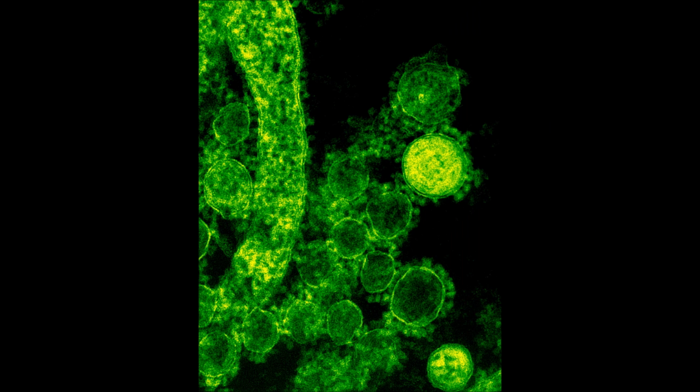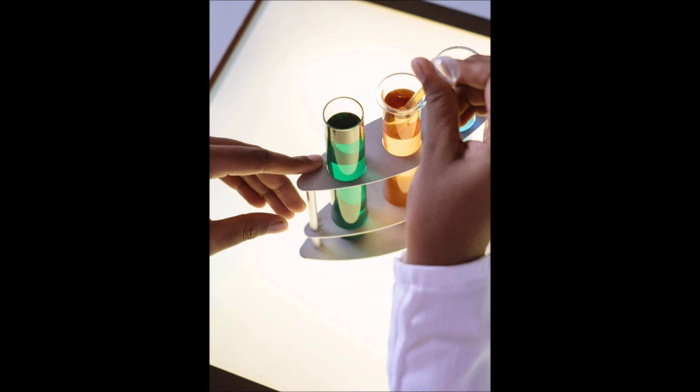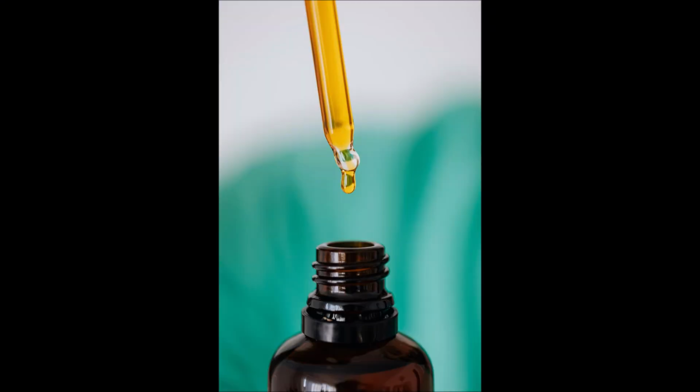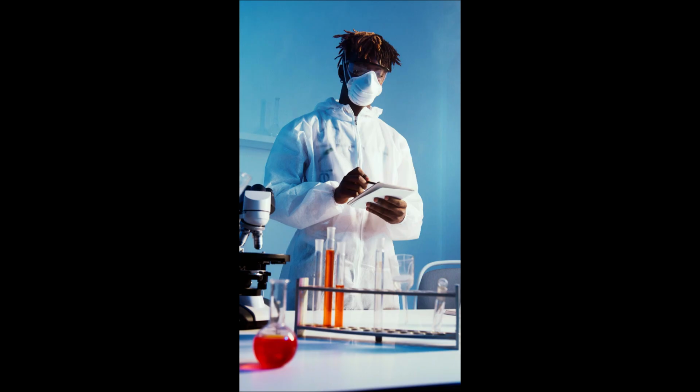Now, for long-term storage of the endophytes which you have isolated, you can use the following. You can maintain cultures on agar slants at 4 degrees Celsius for short-term use, or you can store them in glycerol stocks at -80 degrees C for long-term preservation. You can also use freeze drying. That means you lyophilize the cells. You freeze dry the bacterial strains for extended storage. If you are storing at 4 degrees C, at refrigeration temperature, after about 3 months you have to restock again and repeat the storage so that it can still be viable.